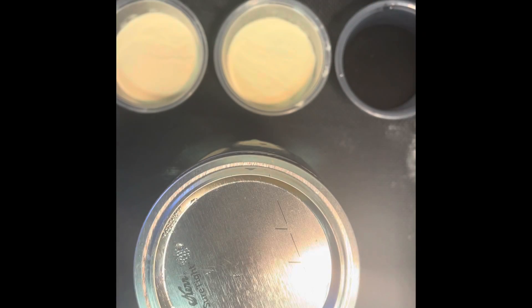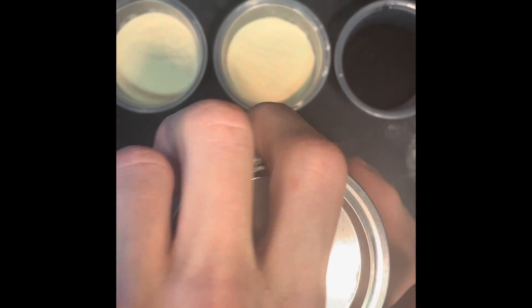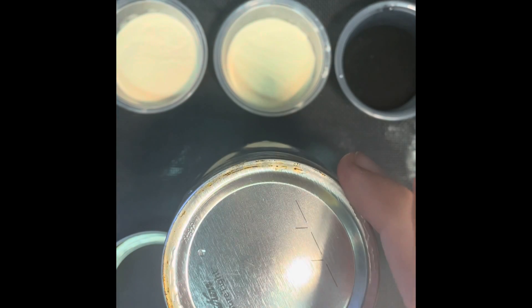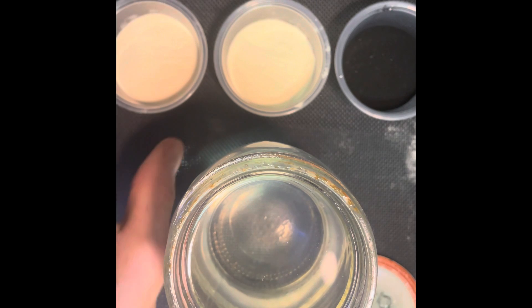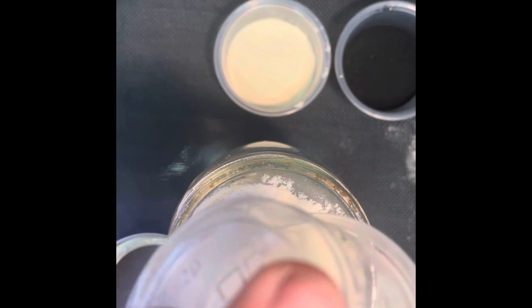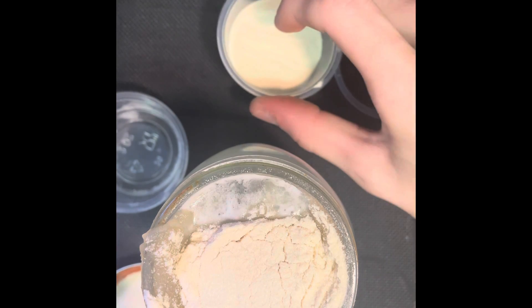After the jar has been boiling for 10 to 15 minutes, you can take it out. Unscrew the lid and take off the second part of the lid. Take the 10 grams of agar agar powder and add it to the hot water. After the agar agar powder has been poured, you can pour in the malt extract. You might need to shake up the agar agar first.